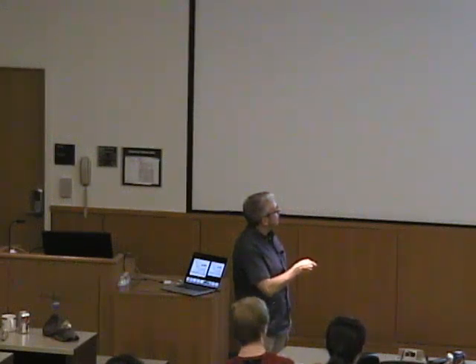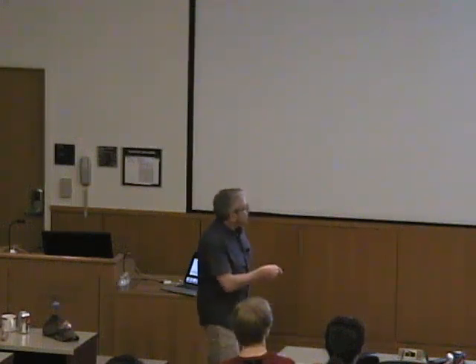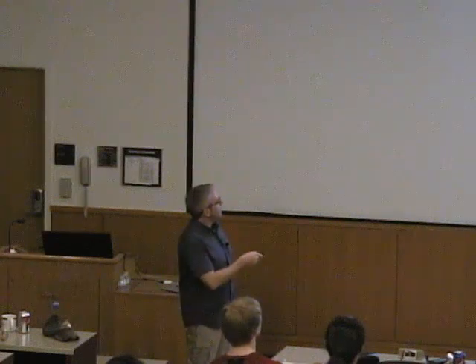And this one obviously cuts the A-axis in one part and the B-axis in one part, and it goes down on B and up on A. So you would call this 1 minus 1. This set of lattice planes would get the indices H equals 1 and K equals minus 1. It's totally weird, right? What are we talking about here?